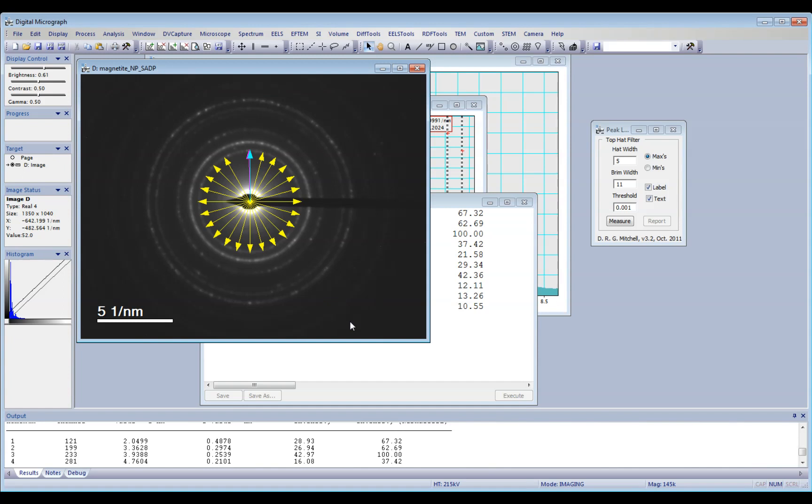Actually, I'm going to show you how to index your ring diffraction pattern.